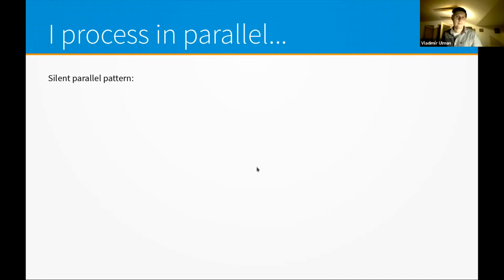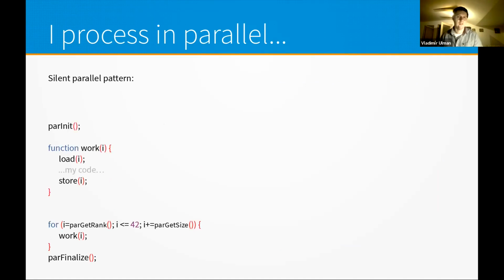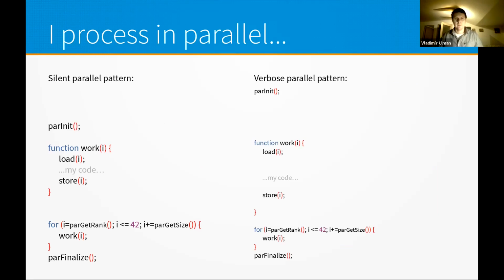For now, let's focus on how we can extend this already parallel code into code that's decorated with progress bars. So on the left is the original parallel code. On the right is the same code at the moment. It's only a little bit more stretched because we will be adding code here and there. We have to start by defining the progress bars. So the macro, again, one macro, one code, executed on many computers. It goes from top to bottom, sequentially, as usual. So first it hits this for cycle. Notice it is the same cycle as down here. So what it does is that this i will go over the same sequence of numbers, and for every such i, it will create its own progress bar with this function.